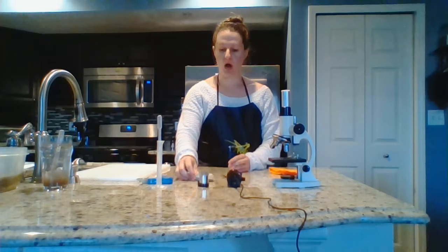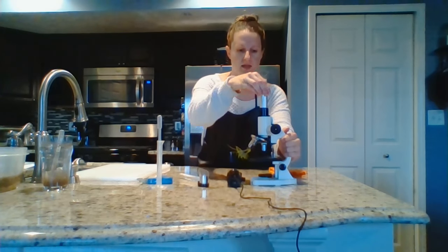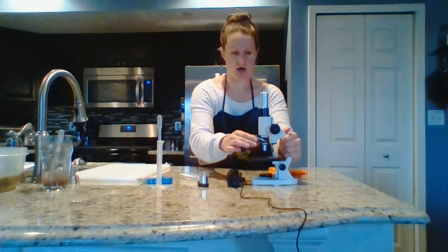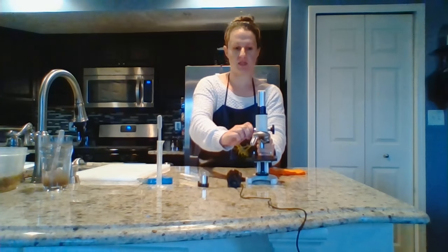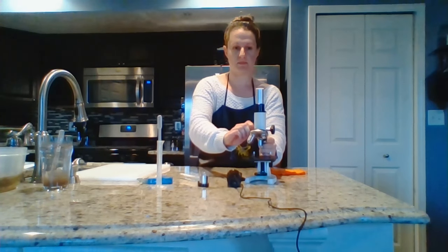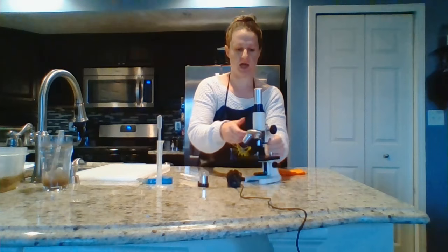This lab has two parts. Part one is simply looking at the prepared onion root slide. In order to get your microscope set up, you'll have to take it out of the box, make sure the lenses are at the lowest level, and make sure it's raised all the way up to the top. If you go too far, just give it a little gentle tap and it'll go back down.